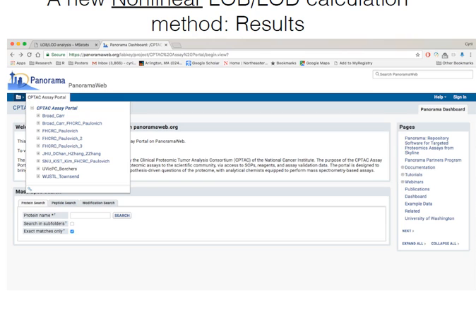Okay, so now I'm just going to talk a little bit about the different data sets that I mentioned before. Online, there's a very nice repository that we talked about yesterday and today, which is Panorama, on which you can find data from a lot of previous CPTAC studies. There's something like 10 here. There are actually many more data sets than those, because each contains multiple data sets.